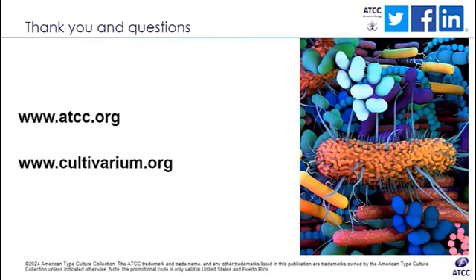Another question someone asked was, have you developed CRISPR-based activation protocols for activation of cryptic biosynthetic gene clusters in bacteria? Yes, so we are constantly developing new tools, and you will have to wait for release soon. And it will be for both random and targeted editing.